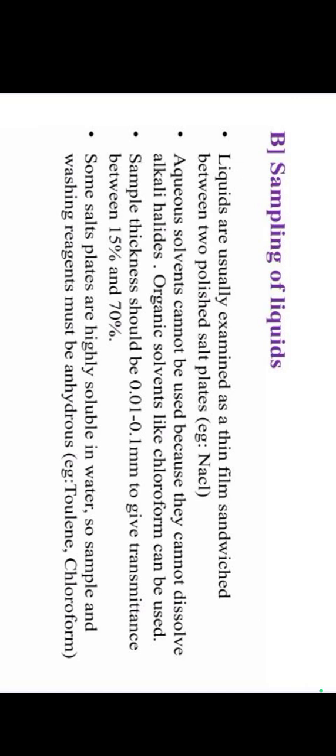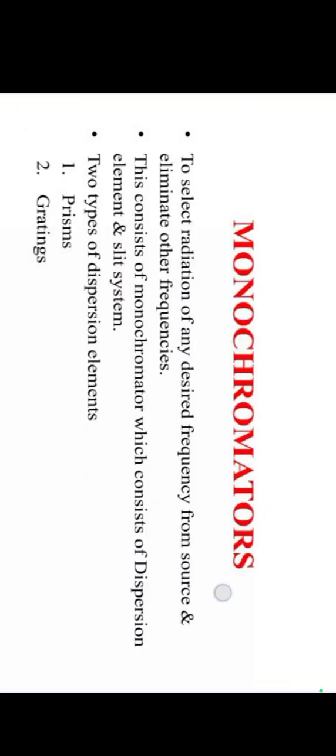Sample thickness should be 0.01 to 0.1 millimeter to give transmittance between 15% and 70%. Some salt plates are highly soluble in water, so the sample and washing reagents must be anhydrous. For example, toluene and chloroform are solvents used in sampling of liquids. These are the pictures about the sampling of liquids.